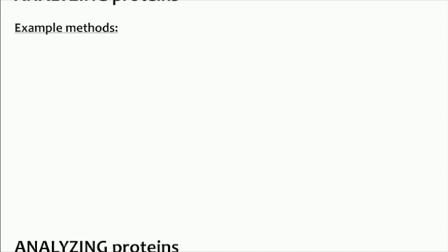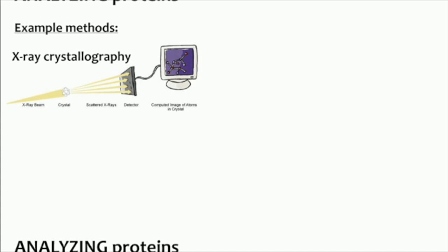So, apart from detecting and quantifying proteins, you can also analyze the proteins directly, to determine what structure they have, what their amino acid sequence is, what their 3D structure looks like. I was not even going to try to make my own pictures of these because they're often complicated. One way to determine the structure of a protein is through X-ray crystallography. That shoots X-ray beams through a crystallized version of a protein. As you know, it's actually pretty hard to crystallize proteins, so for people who do this, the hardest part of their experiment is making the protein crystal.